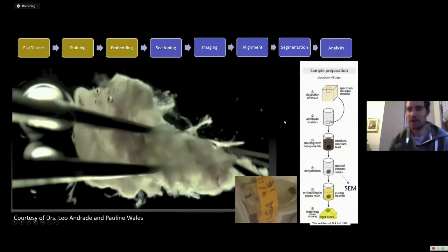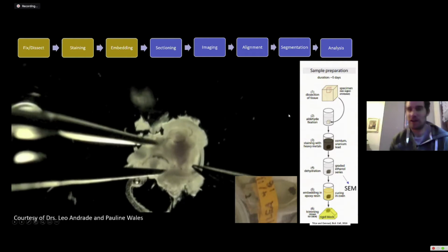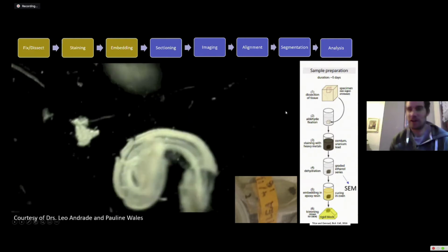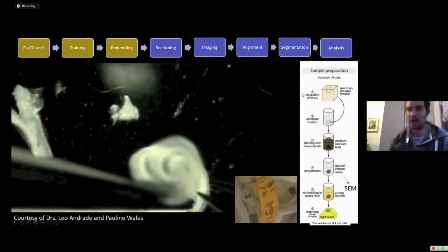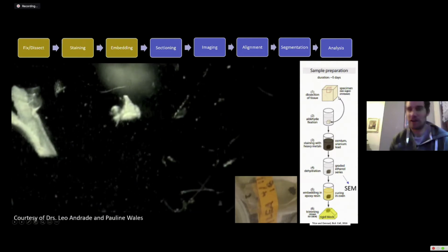This can take an hour for a single ear to dissect. Here you're starting to see him pull out the spiral cochlea. Then he has to take off the tectorial membrane, which is what those hair cells embed themselves in that Uri was talking about. This is a very challenging preparation, all under a microscope with very steady hands.